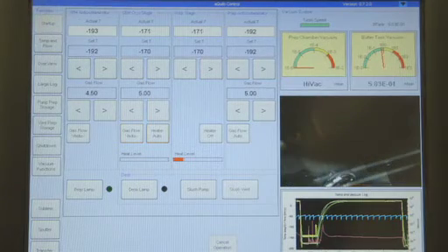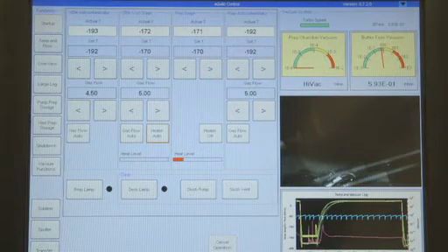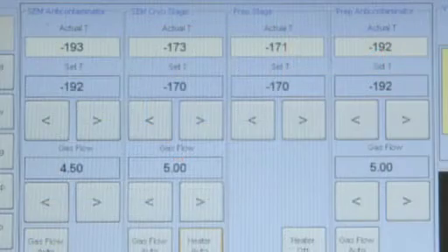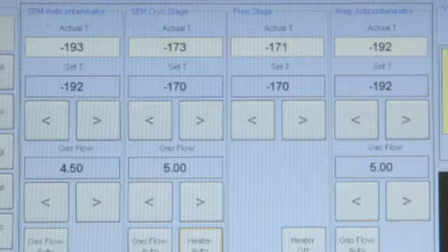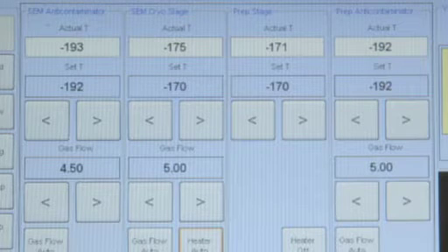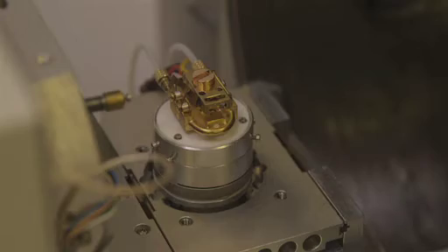Cooling can go down to minus 190 degrees Celsius, or lower, although in practice, cold stage temperatures of minus 130 to 150 degrees Celsius are typically used.